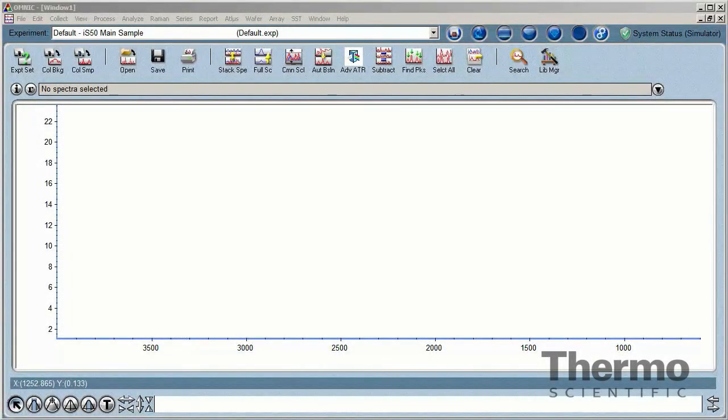Materials can be sampled different ways to produce an infrared spectrum. Various transmission and reflection accessories are available, and the spectral data produced have different qualities. These need to be understood so useful information can be extracted from the spectrum.